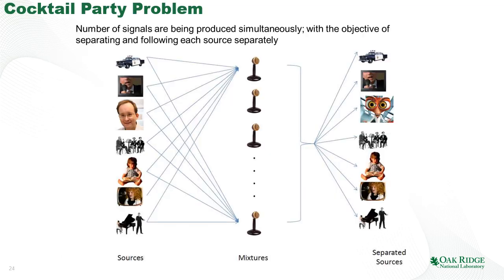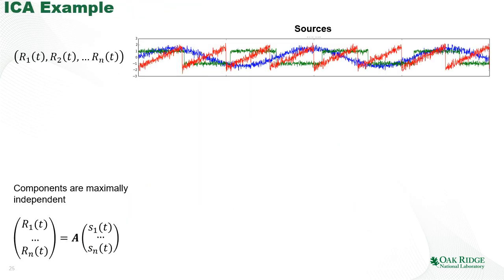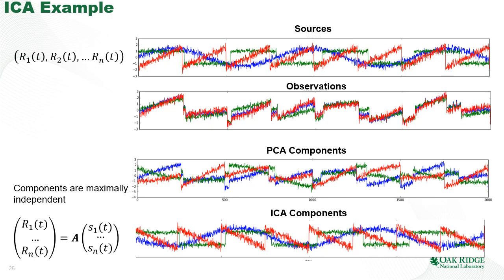Now, this is a humorous representation of how the ICA works when you have several sources mixed together into one signal, and you want to separate them. So the question is how are you going to do that, and what is going to be the outcome. It has recovered the rectangular signal, and it even recovered the triangular wave, but of course only up to the phase.